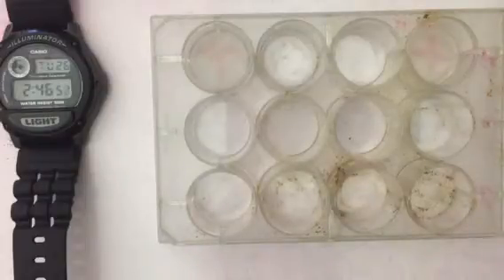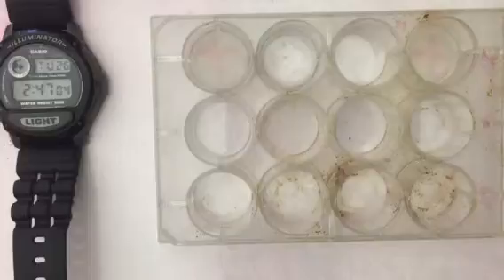Now, the other nice thing is sulfur compounds smell horrible. And with this one, if we create much SO2 or it starts to smell bad, we take a little bit of sodium carbonate or calcium carbonate and dump it in there. Essentially, it's a little bit of a Tums or a piece of chalk. That's all it is. It'll quench it to form something like calcium sulfate, and we're pretty much done.